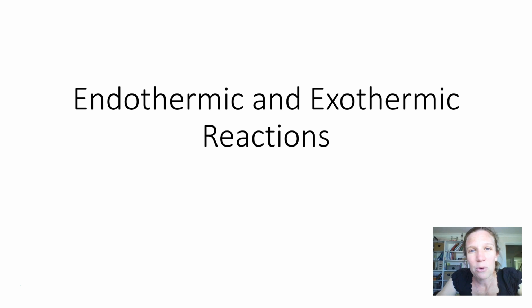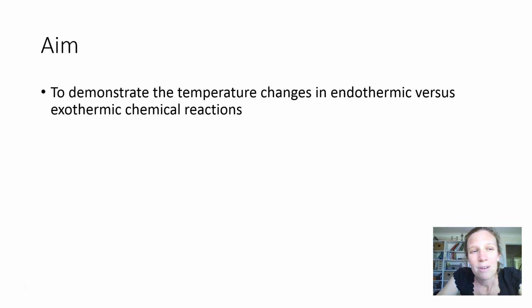The activity that you're going to undertake is fairly simple in terms of its method, but it's very, very important that you pay careful attention to the white powders that you're using. It's very easy to confuse them. So you need to pay careful attention for safety reasons, and I'll draw your attention to that when we get to it. First of all, your aim is to demonstrate the temperature changes in endothermic reactions versus exothermic ones.